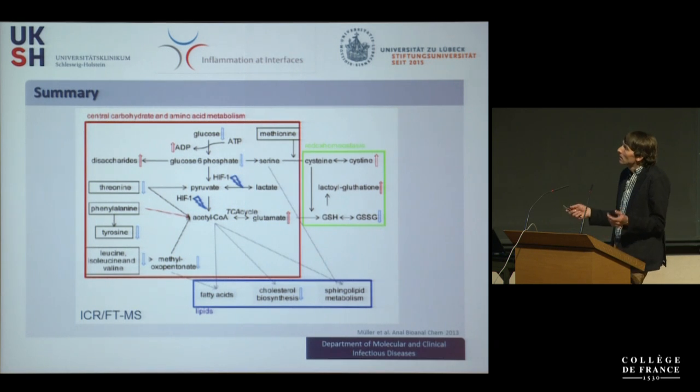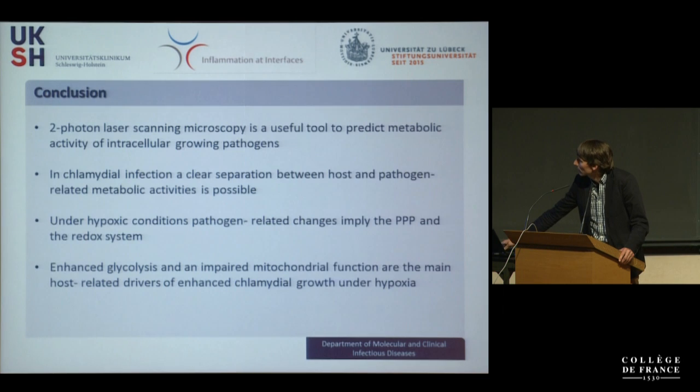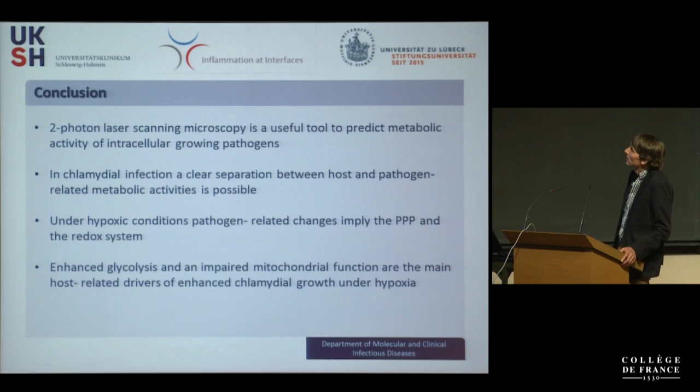And to bring that to the end and integrate also the mass spectrometry data, you can then end up from this very simple two-photon scanning at the beginning with a very complex picture where we now integrate the data which we have from the Seahorse analyzer, from the mass spectrometry, from the transcriptomic analysis, and then we end up seeing that this redox homeostasis, which is regulated apparently mainly by the host cell, but also the HIF-1 alpha response, which is mainly driving the glucose uptake and also the abrogation of the lactate, is the driving force in chlamydial intracellular growth.